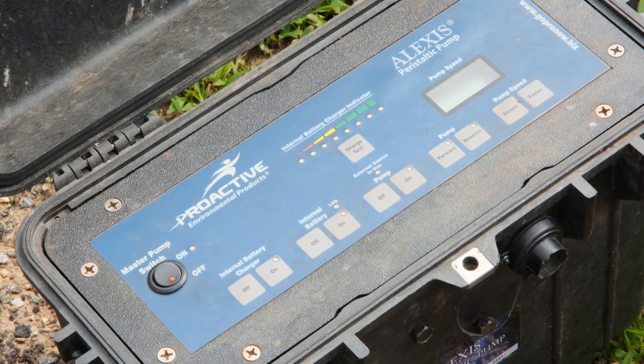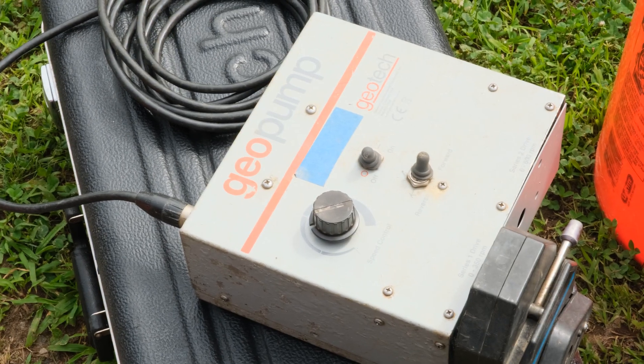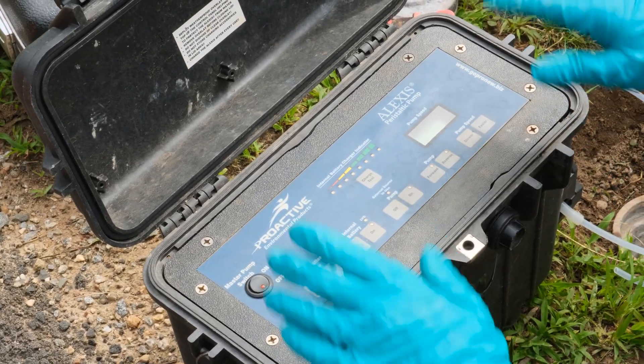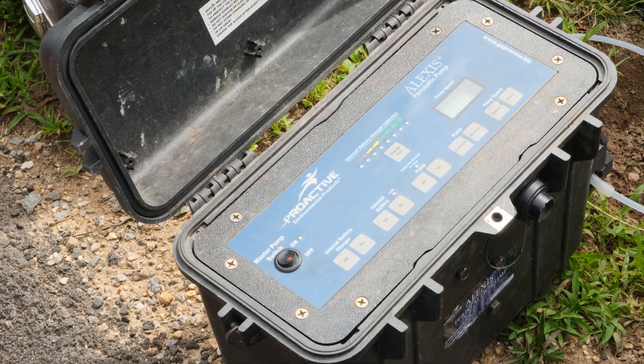We have two different types of peristaltic pumps. This is the newer style Proactive that's digital, and our older style Geotech pump which just has a speed control on it. Both have the same pump heads. The newer style has multiple switches — it's pretty simple to use. There's a master on/off switch; turn it on and let the system boot up.